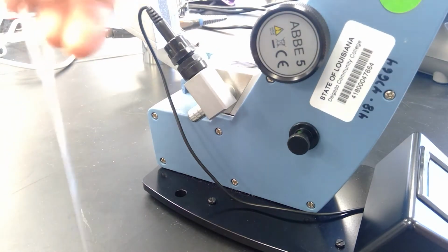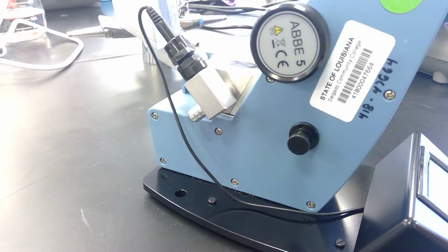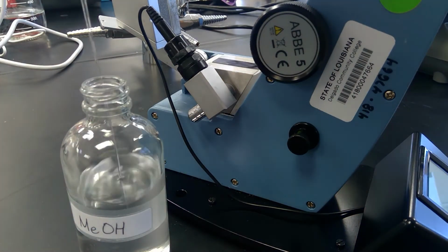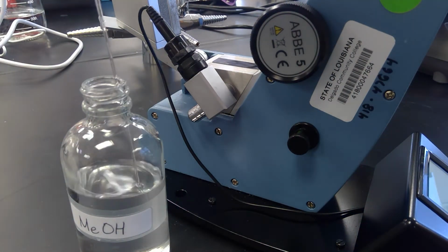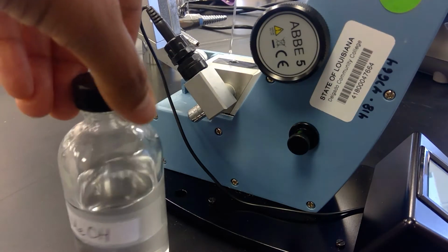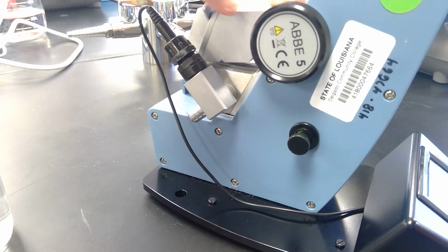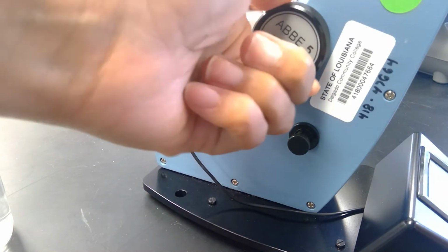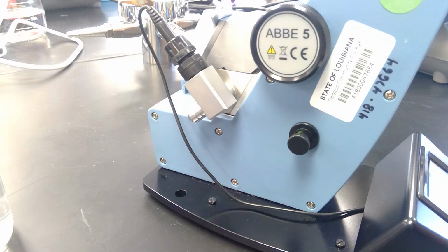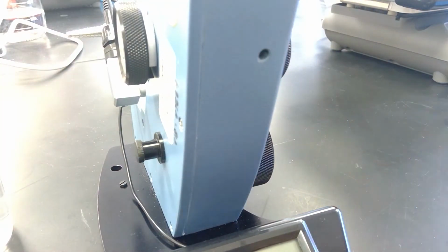I'm going to take my pipette with its bulb, get my methanol, and I don't need a lot, just enough to cover the area. Put my methanol, close it down, and then now we need to adjust.